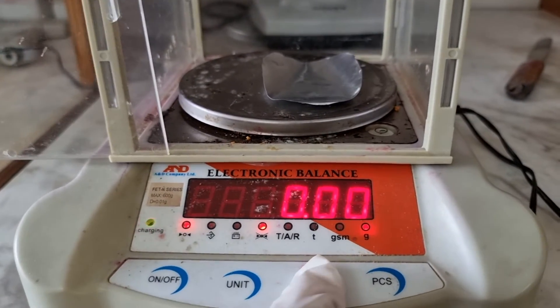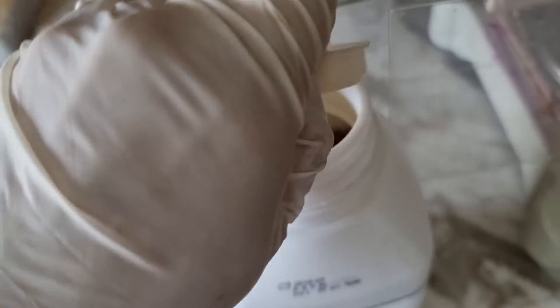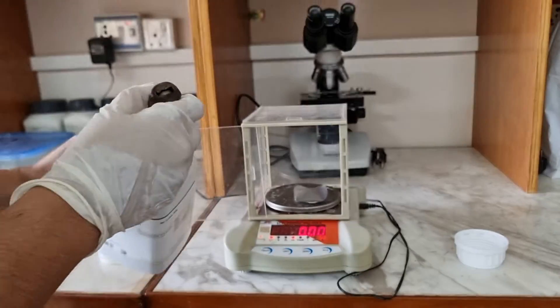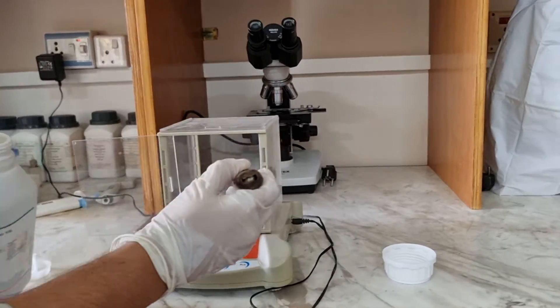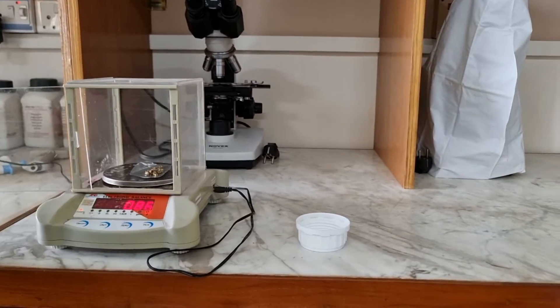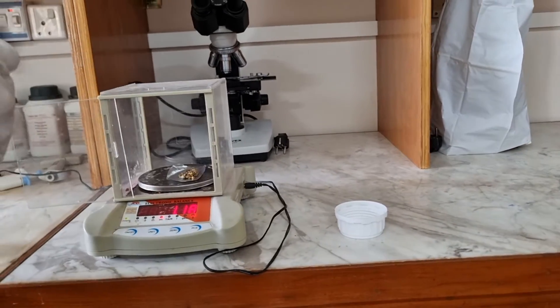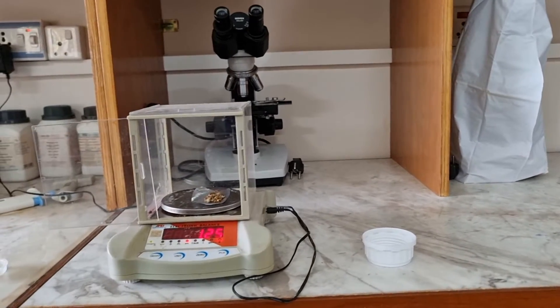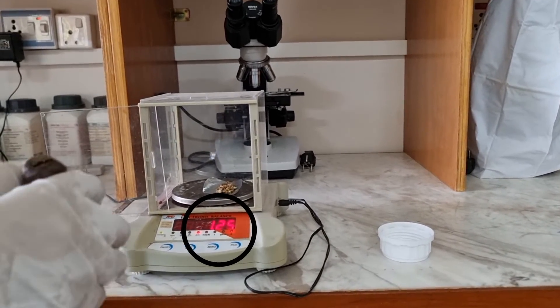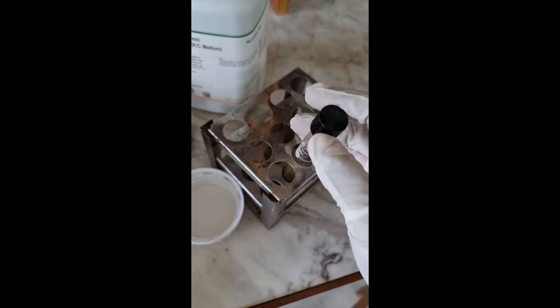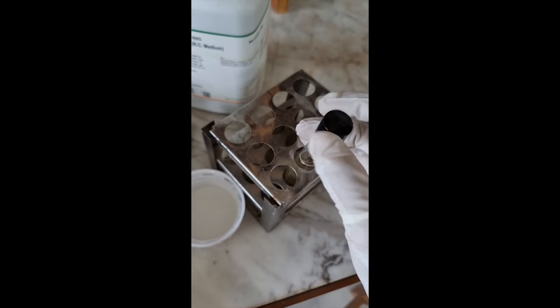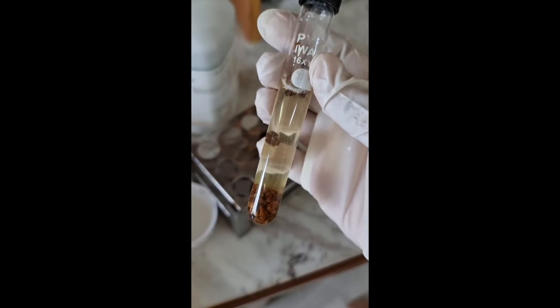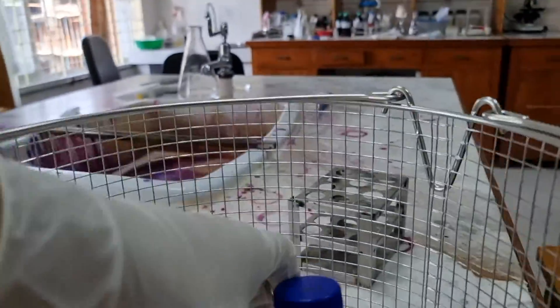Then we're gonna measure 1.25 grams of Robertson's cooked meat media. After mixing thoroughly, we allow the mixture to stand for 15 minutes. Finally, it's time for autoclaving.